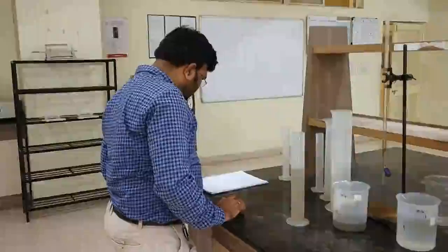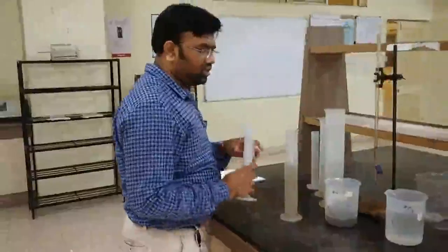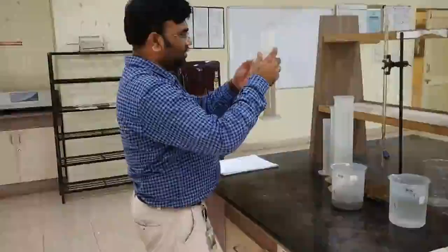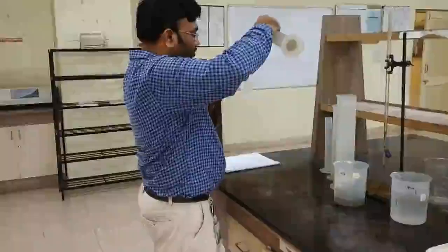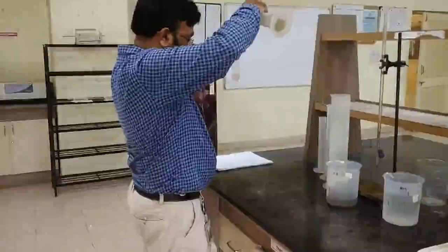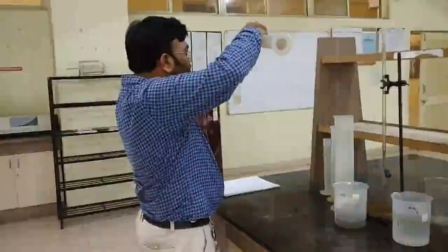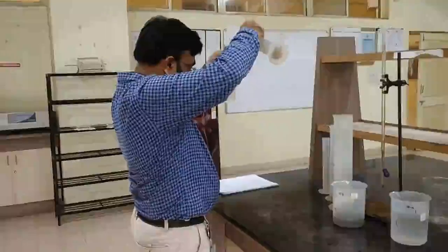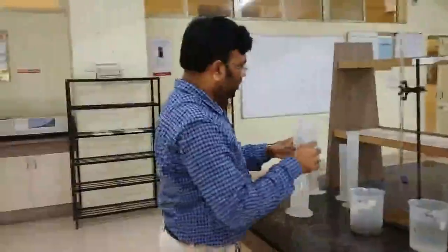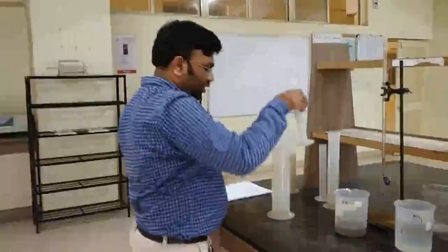The next step is to take 25 ml of sample from this diluted sample. So I am going to measure it with the 100 ml measuring cylinder, and I will be adding it to a 1000 ml measuring cylinder. Right?